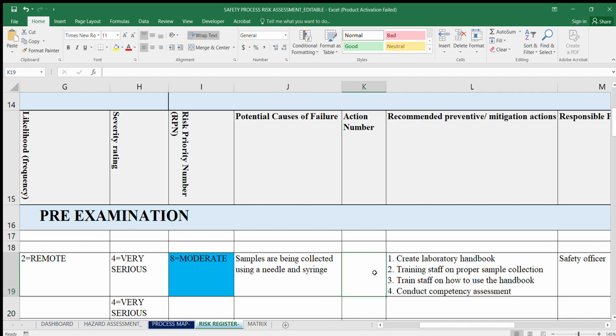But if you've done your preventive action and you've proposed preventive actions, you're supposed to put these preventive actions on your preventive action log. So the log will have sequential preventive actions. So this potential action will come from your root cause analysis. Maybe this potential cause will be 009, which is number 9 on your action log.